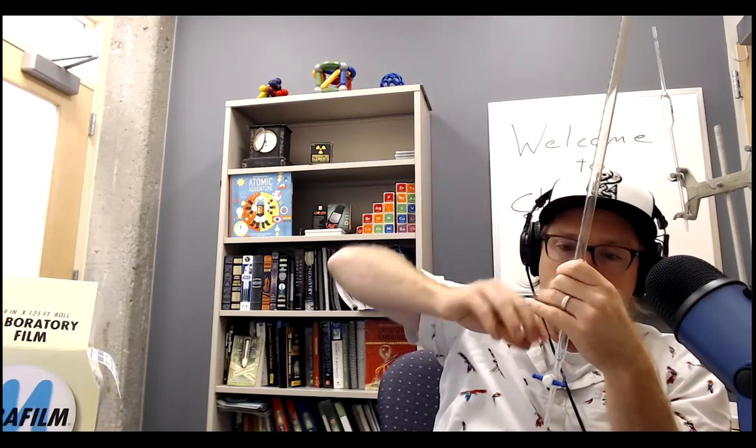When you fill this up, you want it to be closed, and it's closed when it's horizontal, parallel to the ground. Now I can be sure I'm going to start filling it up. Only do a little bit at first. I've got my funnel in there. You've got 10 mils. Take the funnel out.